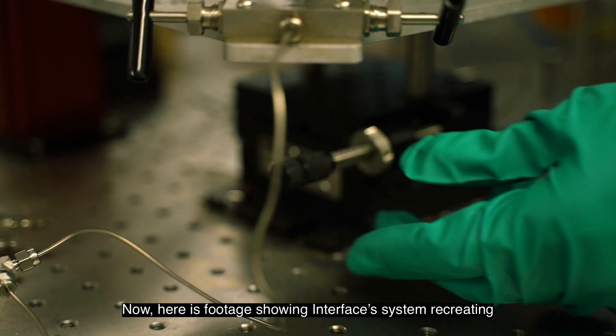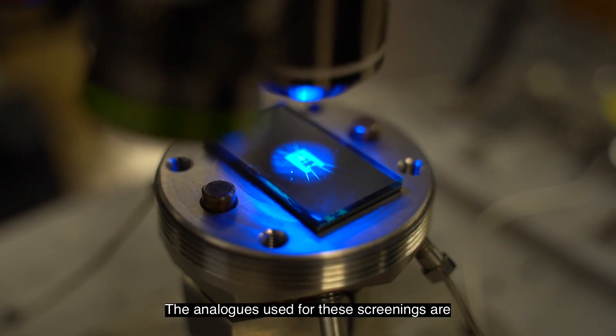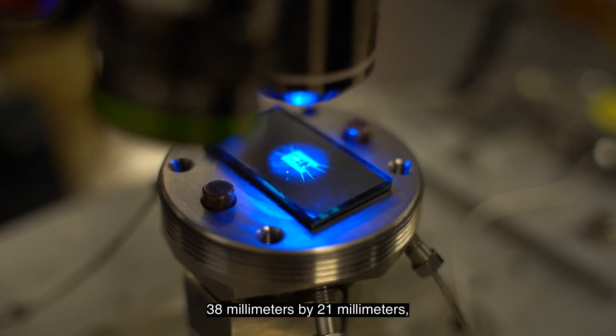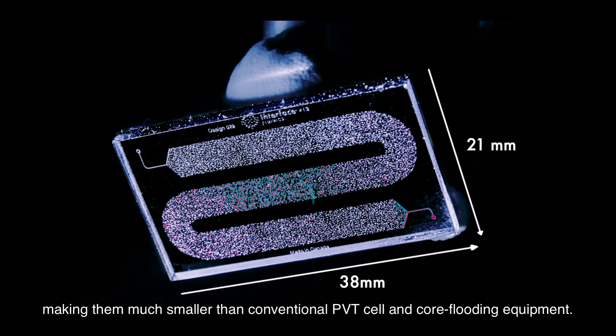Now, here's footage showing Interface's system recreating this immense pressure in a lab setting. The analogs used for these screenings are 38 millimeters by 21 millimeters, making them much smaller than conventional PVT cell and core flooding equipment.